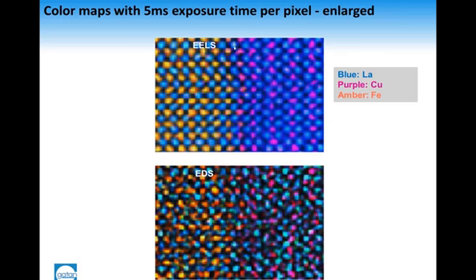layer. This is looking at this interface in more detail, and basically we don't get any information in EDS. The information is completely missed. This actually is the key to characterizing this material, this interface. This is the reason why this interface doesn't show good electrical properties.